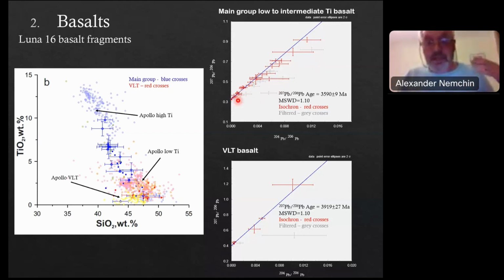We're trying to identify this leftmost best-fit line, and believe that it represents a lunar lead mixture of this very radiogenic material and initial composition type of lead, free of contamination. When we identify this line, we believe that we got the age from the intercept of the line. Again, we cannot analyze uranium here because the phases in our targets are very small, so we're analyzing multiple phases in a single spot.